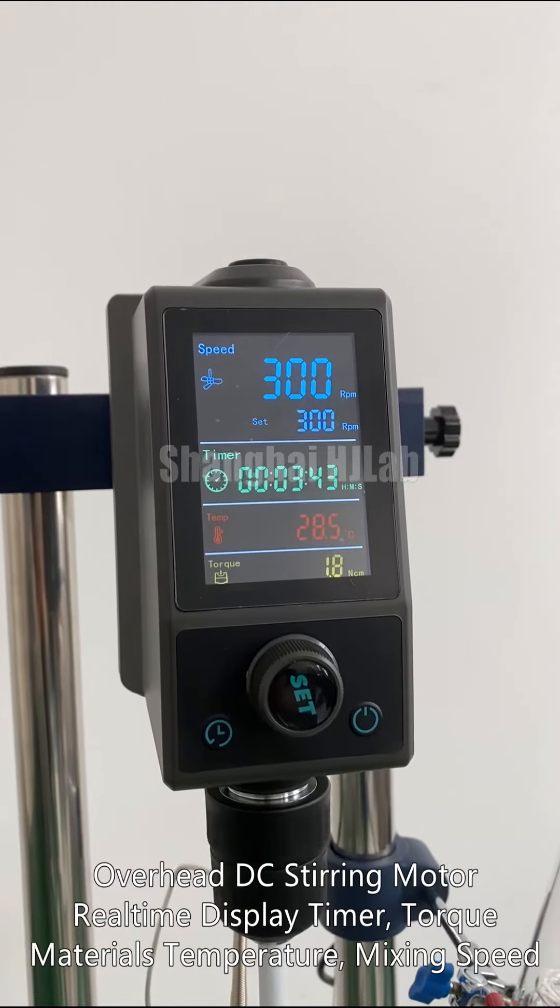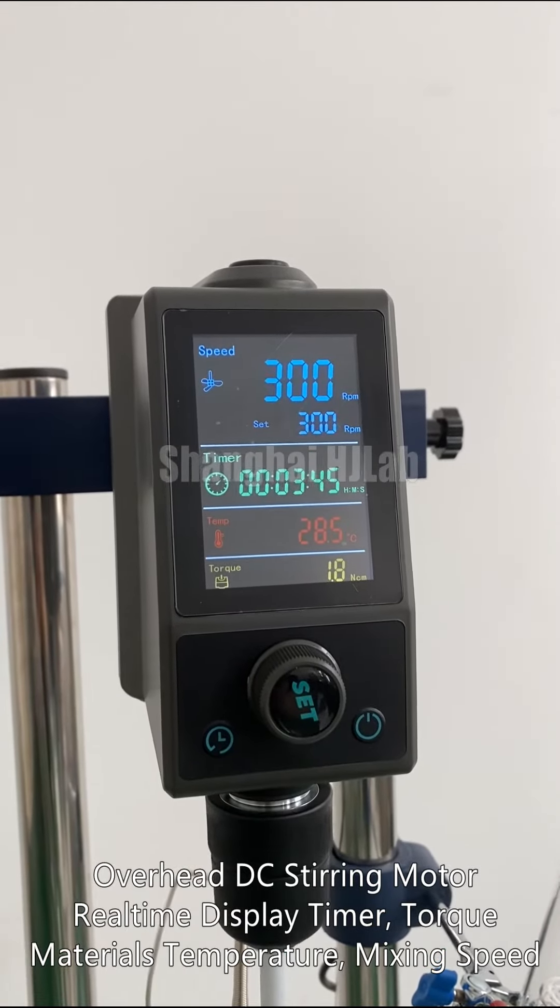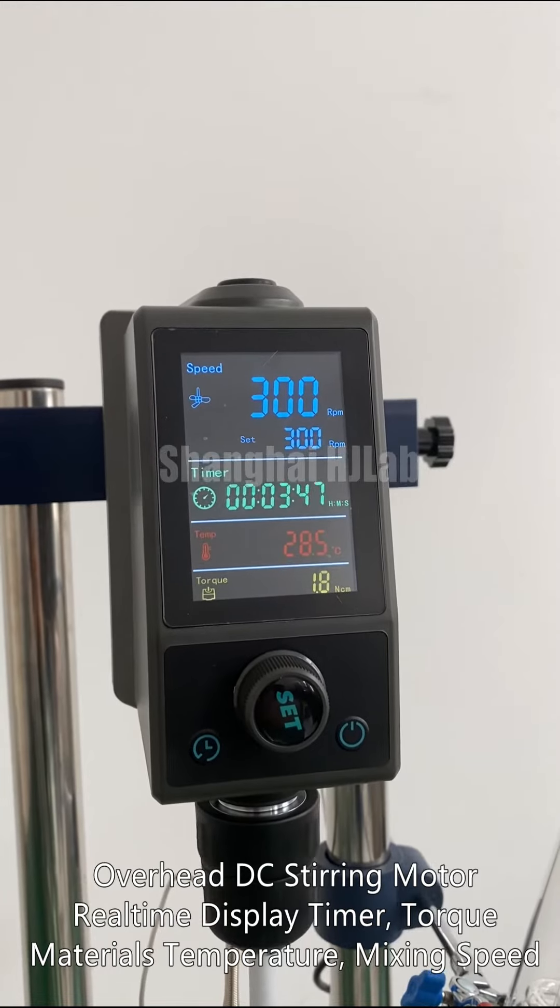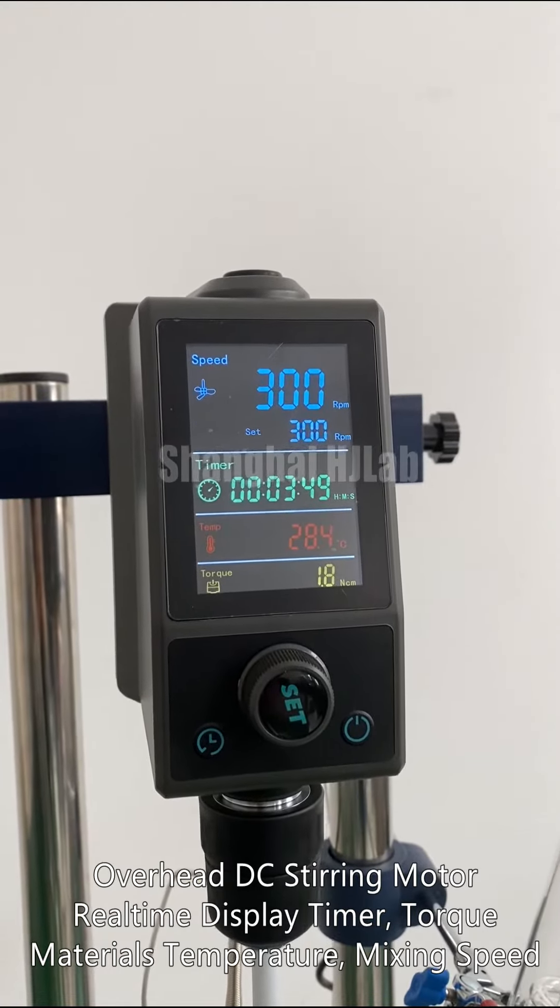Overhead DC stirring motor with real-time display: timer, torque, materials temperature, and mixing speed.